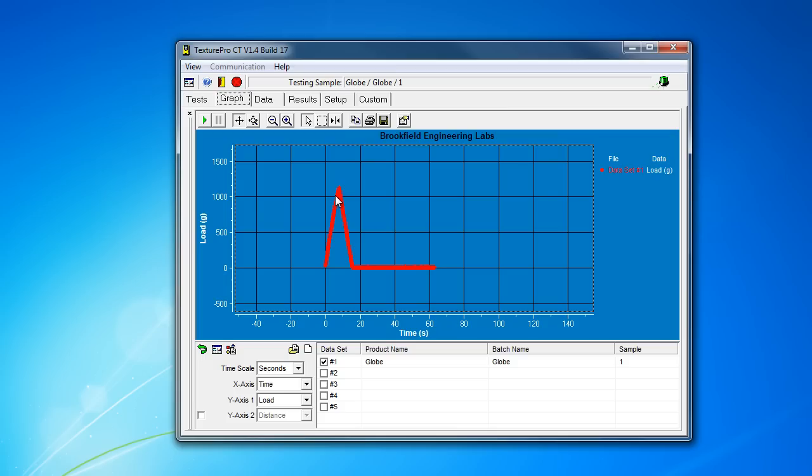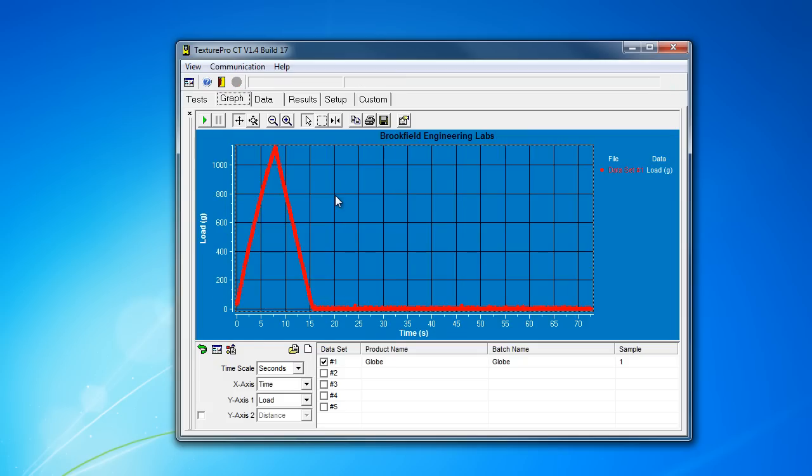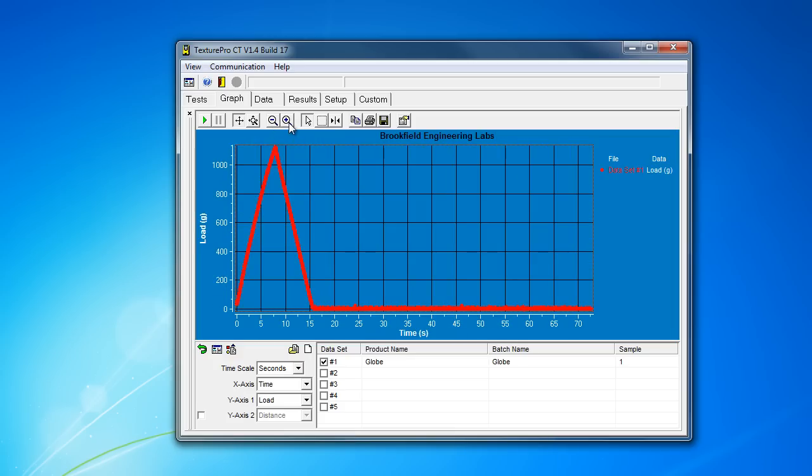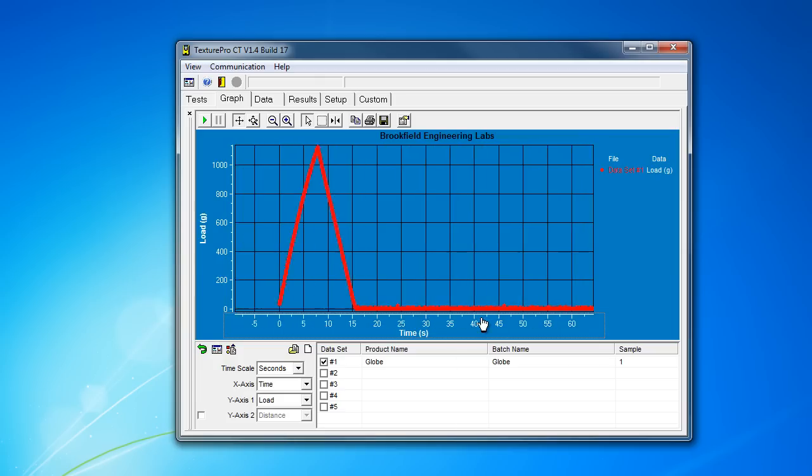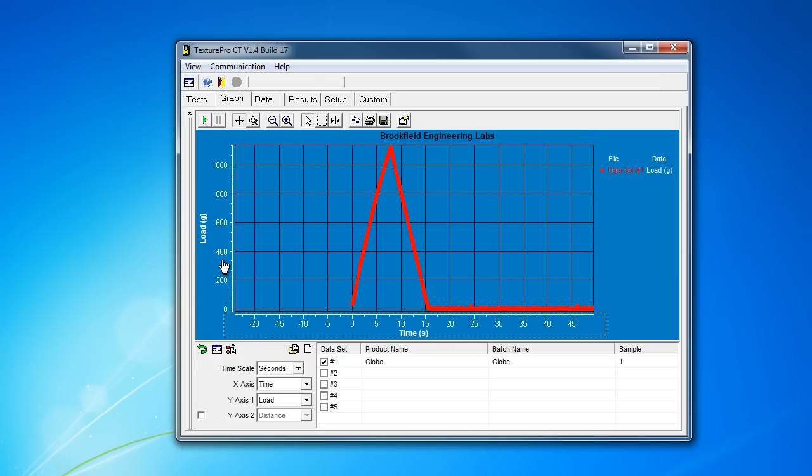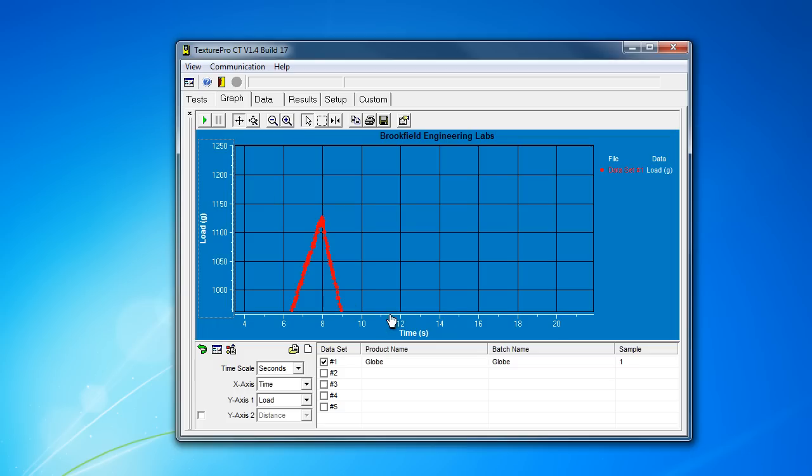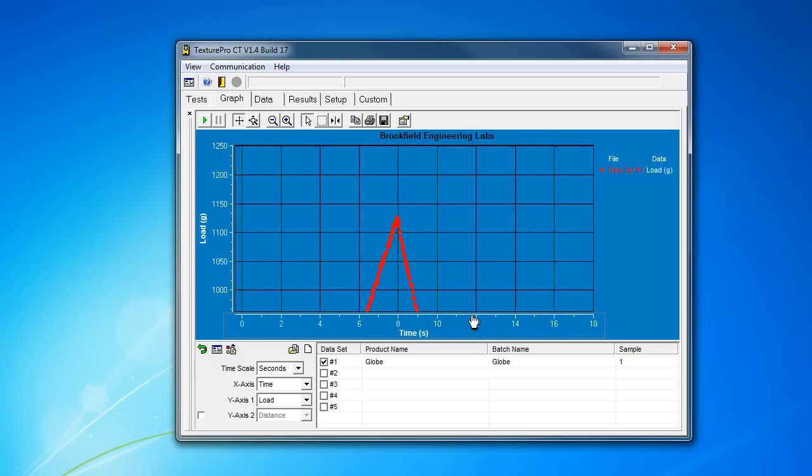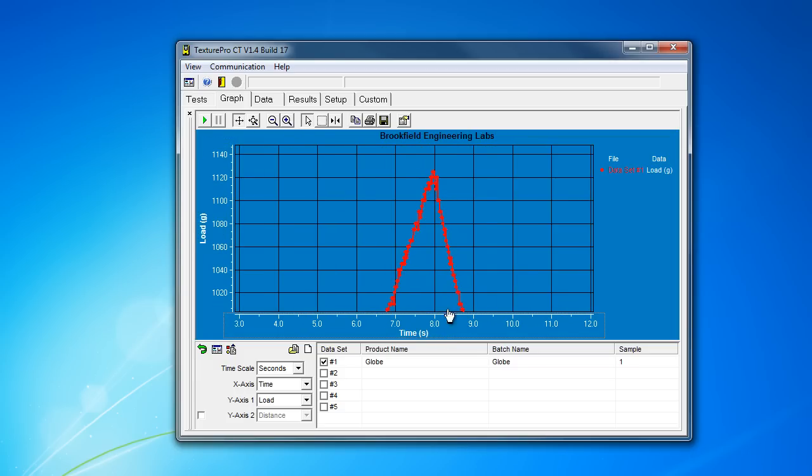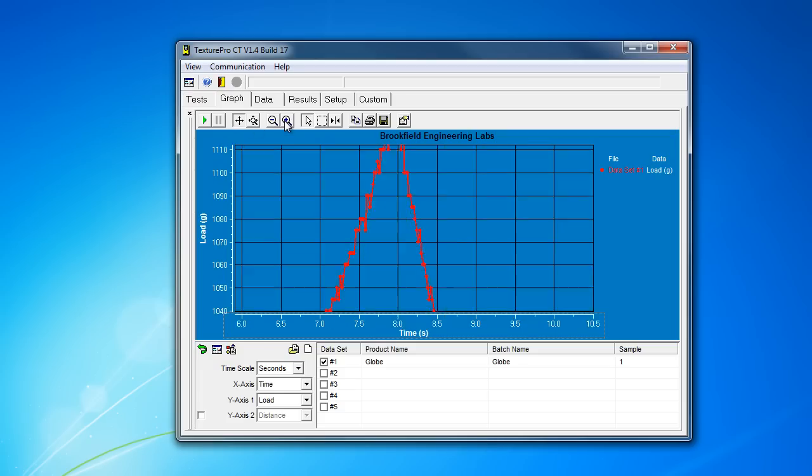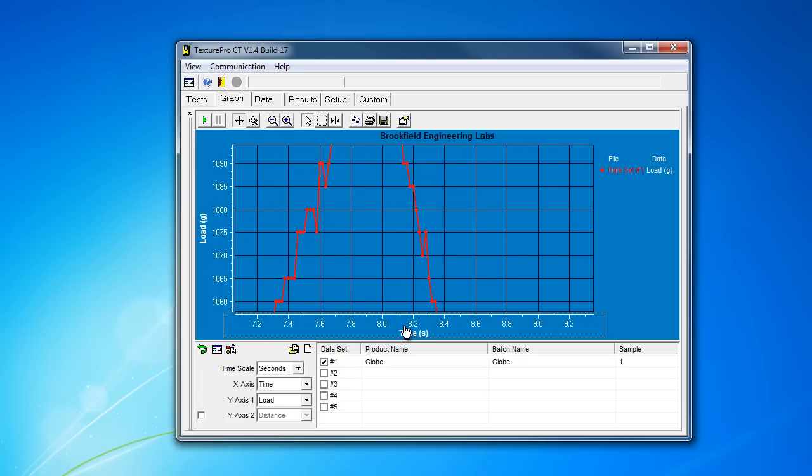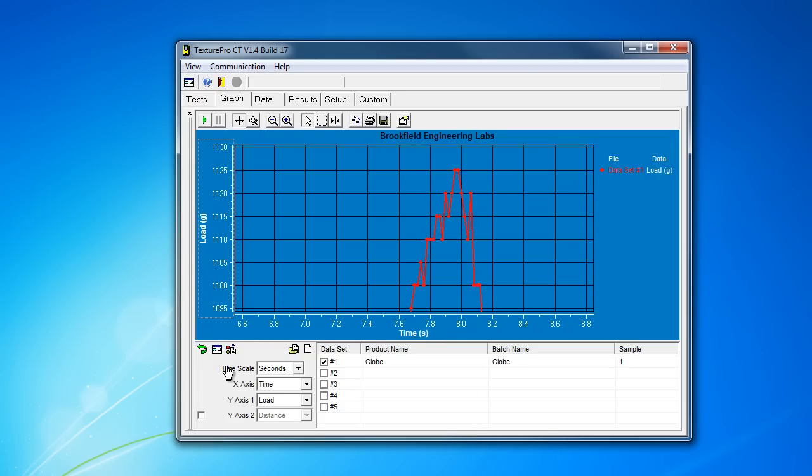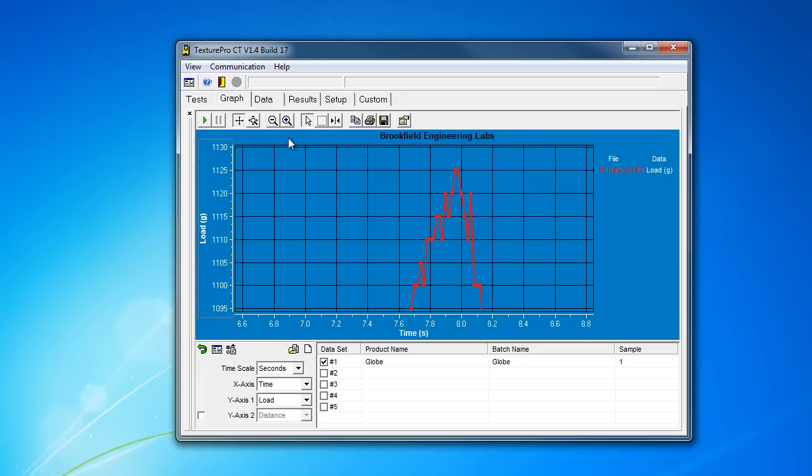The first thing you'll notice is that the actual navigation of graphs is very clumsy. If you want to zoom out or zoom into your graph, it likes to zoom into the middle of the chart instead of your graph. One of the things you do is you end up having to use these, actually drag the axis bars to view your data. Oh my gosh, a pain, absolute pain. The comparison we'll make is it's like moving the road if you're trying to parallel park your car. It's just not worth it.